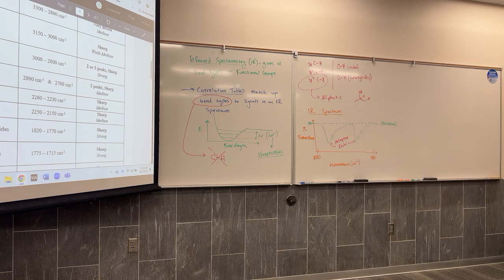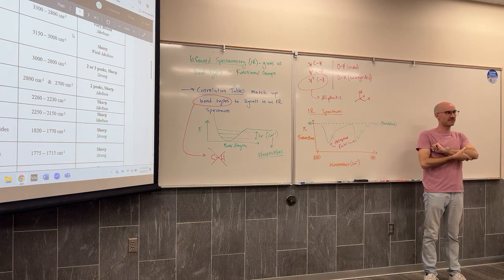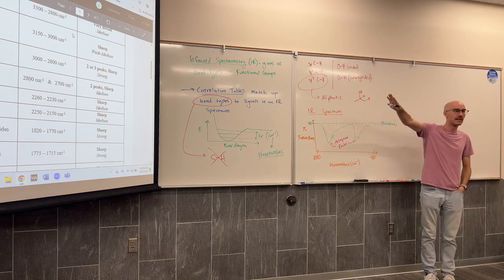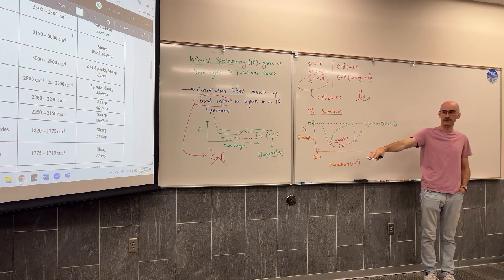And that changes the absorption because the magnesium is now no longer a part of it. Color changes. Back to the IR though, not the visible. Okay, so there's a few ways that we want to analyze this, and just to make it clear, this correlation table is organized from high frequency to low frequency.